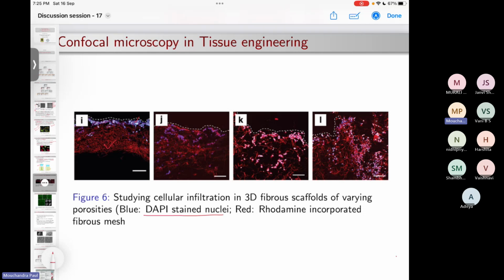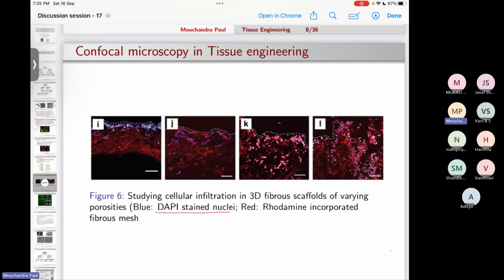Okay, so for tissue engineering, it is a very common technique that people use, because ultimately you are going to make a 3D tissue sample, and in order to show how the cells are moving or how their properties and morphology are changing, one always uses the confocal microscope. Better to use the two photon one, so that you can use it with your thick tissue samples.